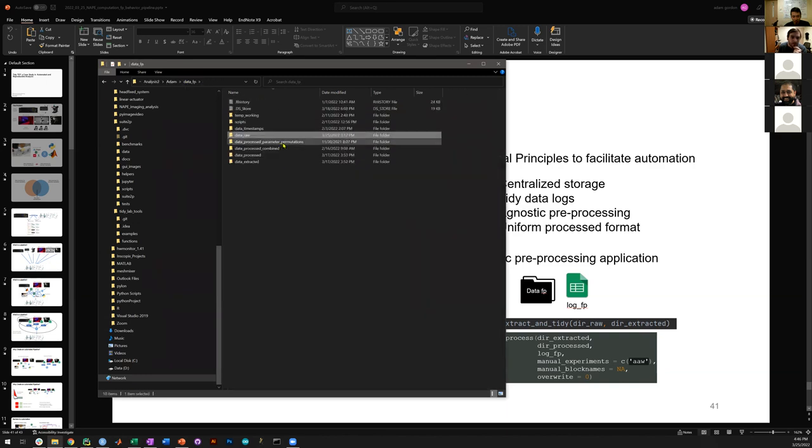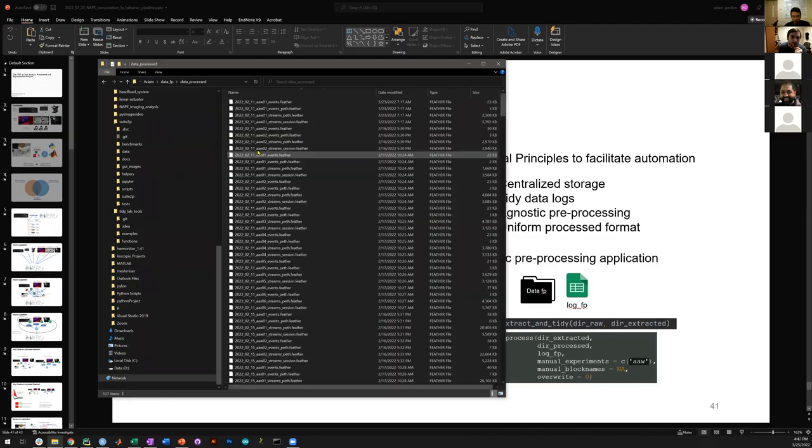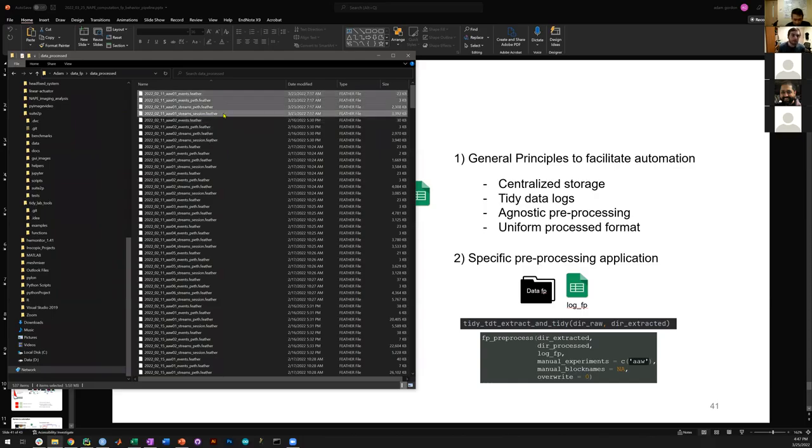Oh, wait, this is the wrong folder. So these four files make up one recording session. The largest one is about 3 megabytes, so fairly small. It's downsampled to 20 hertz. You specify the frequency that you want it to be.